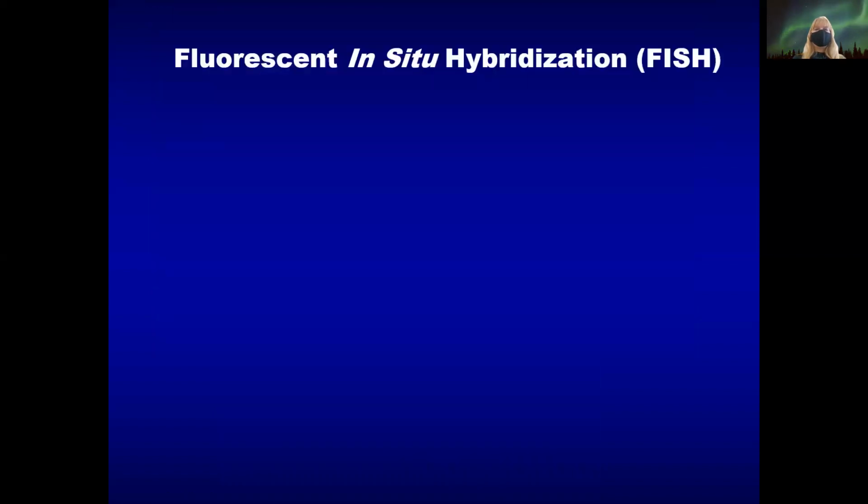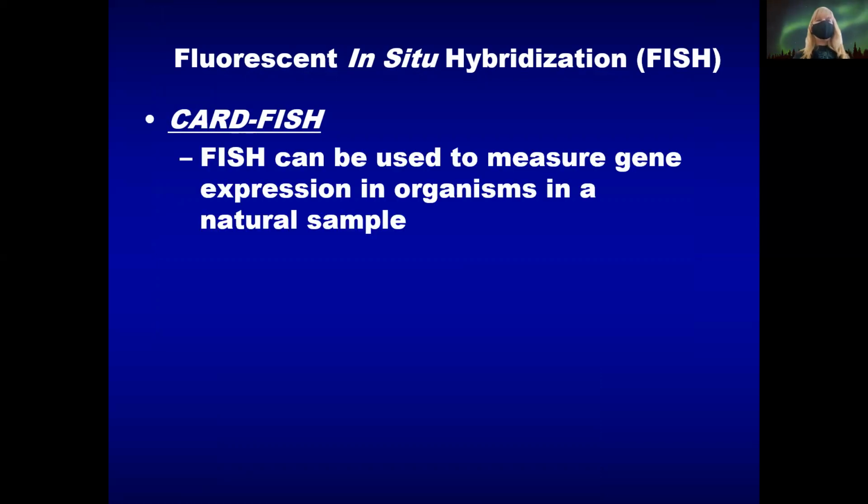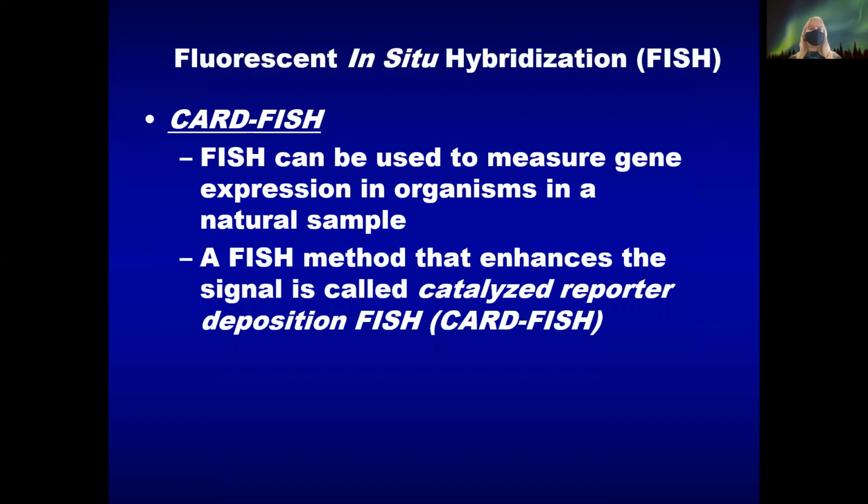And then another one that's more recent is kind of a tweak to the FISH procedure. They call it CARDFISH. You don't need to know what CARD stands for, but if you're interested, it's catalyzed reporter deposition.